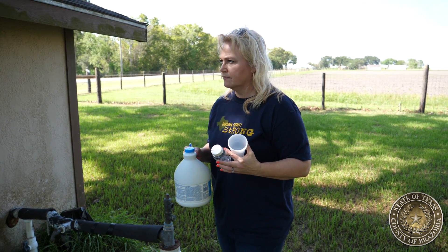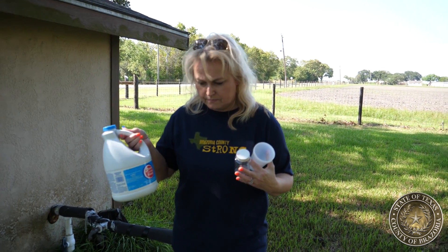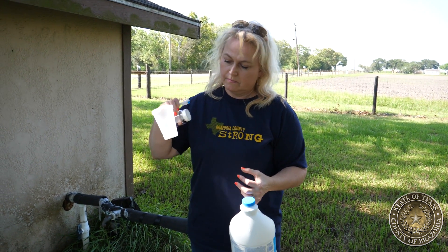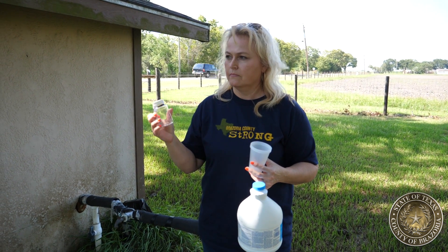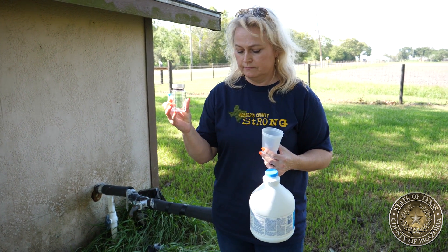First, let's look at some supplies that you'll need to properly collect the samples. You'll need some bleach, a toothbrush, a cup to use the bleach and to soak the spigot, and a water collection sample kit that you can pick up from the water lab.